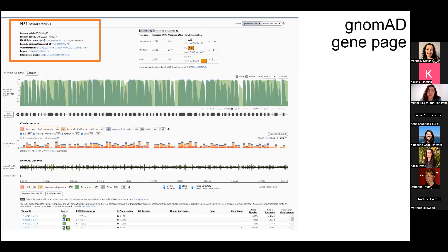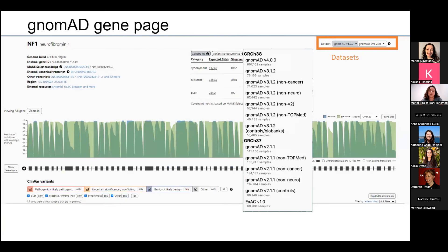In V4, we can also see the main select transcript, with the main select providing the Ensembl and RefSeq matched transcript. On the top right-hand side of the page, there's a dataset drop-down menu showing all different datasets divided by reference genome version — GRCh38 versus GRCh37. You can flip between datasets if you want to look back at a different version. Note that V4 will not have a non-cancer dataset, as there isn't a cancer-recruited subset included in V4.